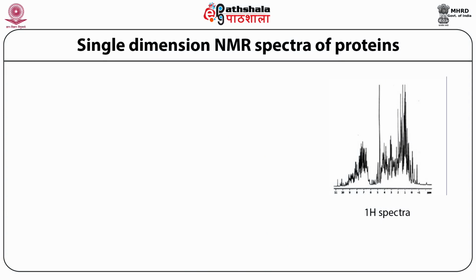If you have a protein with a large number of atoms and many nuclei, the spectra will be much more complicated. Here we are looking at nuclei which have an odd number of nucleons, so that nuclear magnetic resonance can affect them. In the protein you have hydrogen, which gives this information. So the larger the protein, the more hydrogens there are.